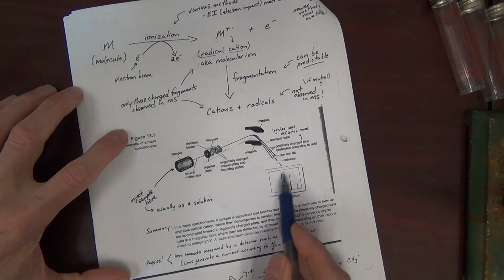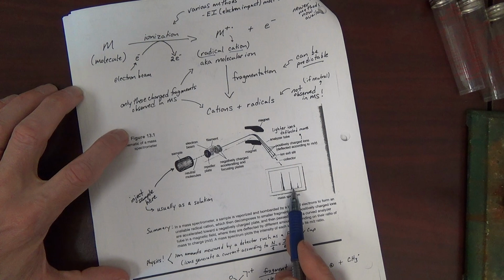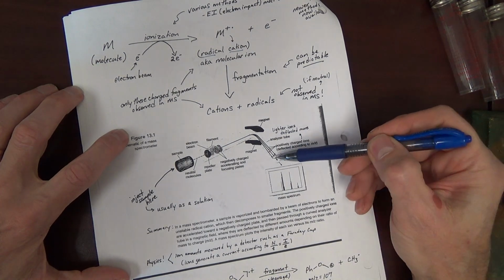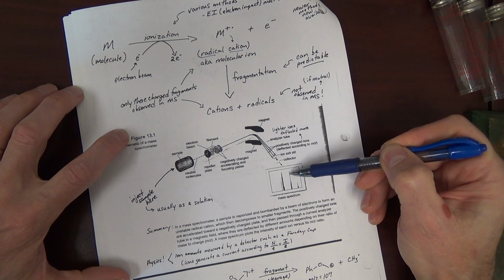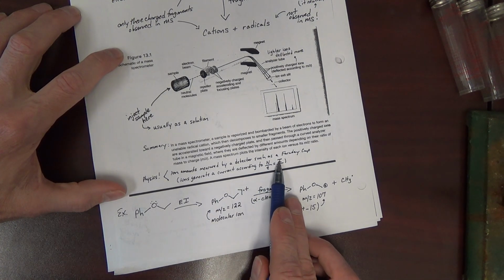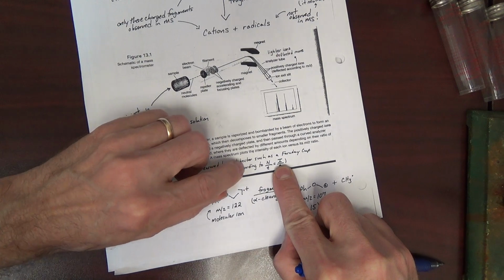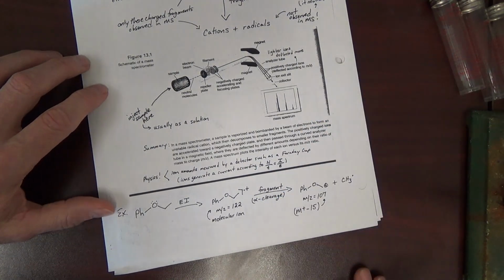Okay. By the way, there's other technology in here. There's other physics. For example, these peaks we see here are really signals. The signal really comes from current that's generated by the particle. More particles were apparently hitting the detector here than here, so more current was generated here. We know the relationship between particles and current because in physics you learn something like this equation here, where number of particles per time equals current. I believe this is probably charge. If charge is 1, we can just call that denominator 1, and basically number of particles per time equals current. The more particles, the more current. And so this is essentially how you get your signals. But that's just a little physics application.